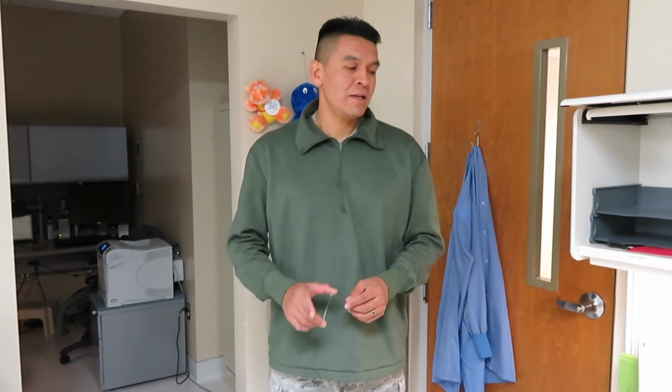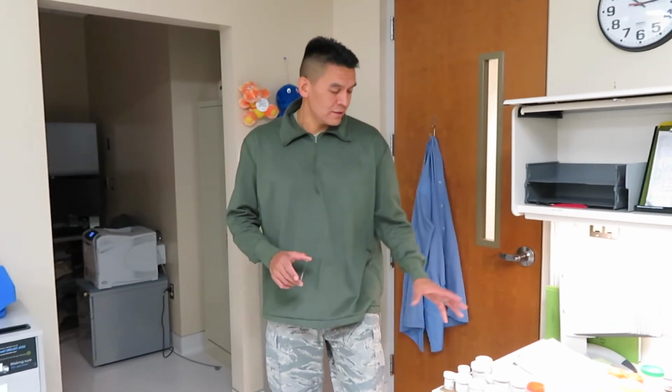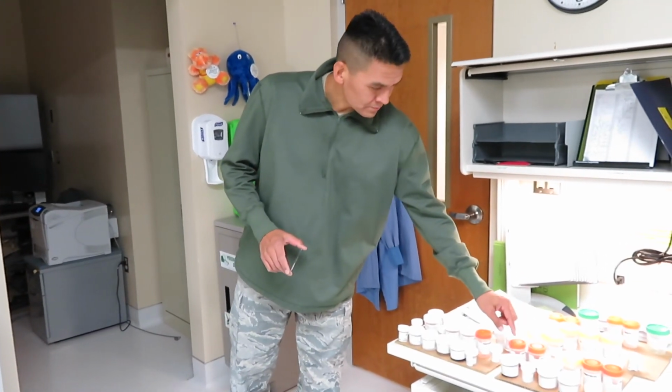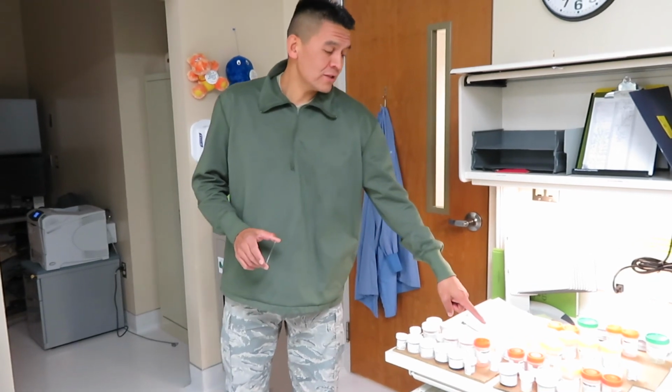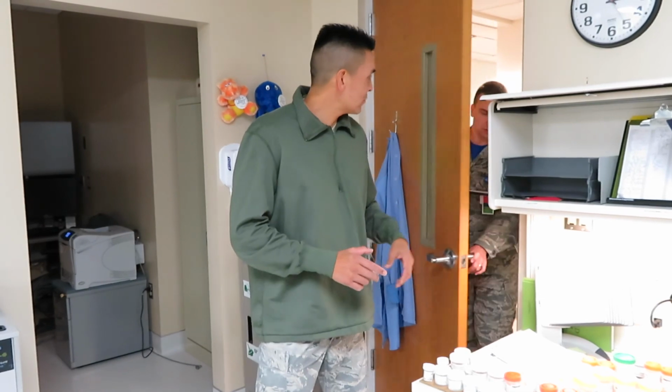Anyways, the first step is we get specimens from the OR or from clinics, the different clinics, and each of these containers has a fixative solution in it called formalin.